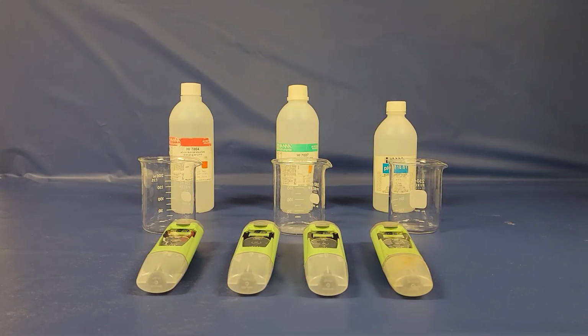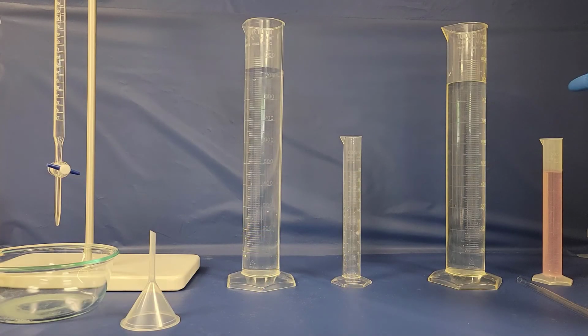In today's video, we're going to be learning about titration and travel time. We're going to be using acid today to determine that. So there's really three things that we want to work on today. The first is before we can do the titration, we have to calibrate our devices. So we're going to go through the calibration procedures of some pH meters. And then the next thing is we're going to develop a titration curve, show you how we do that.